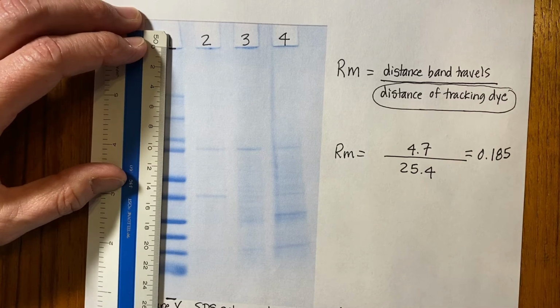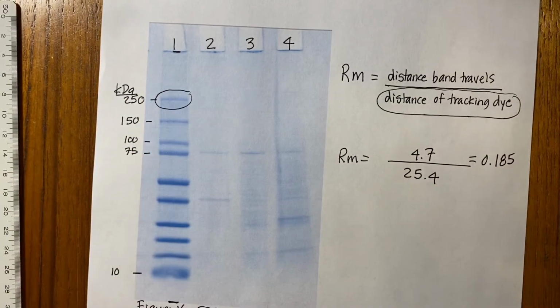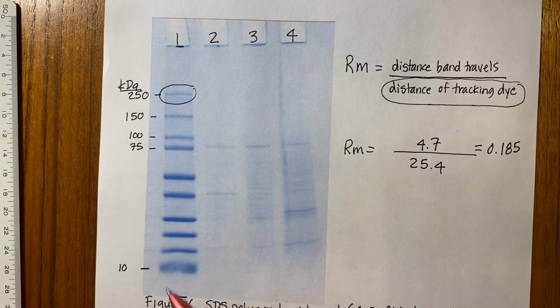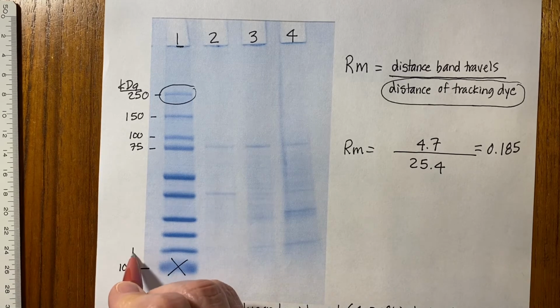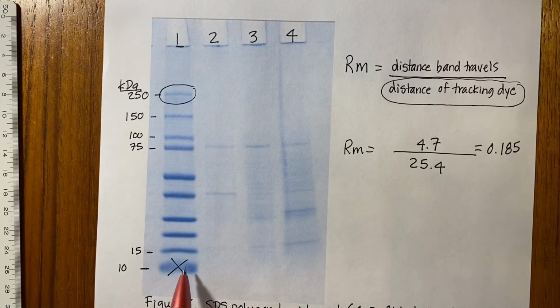So that would be our RM for the 250 kilodalton molecular weight. So do that for all of these molecular weights except the bottom one. I would skip the 10, just do the 15 and higher. This band is so wide and blurry, it'll be hard to get an accurate measurement on it. So just do the other ones.